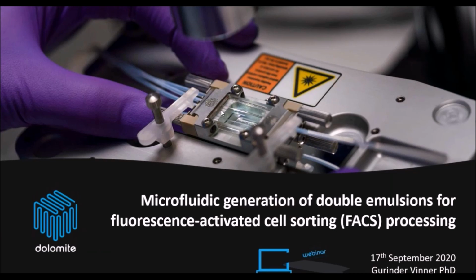Okay. So the topic today we want to discuss is microfluidic generation of double emulsions for fluorescence-activated cell sorting processing.